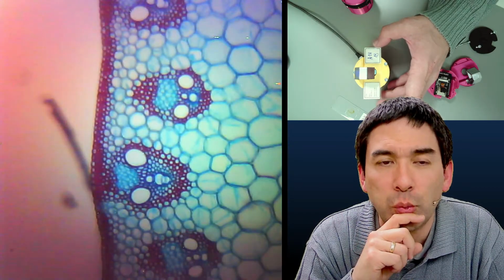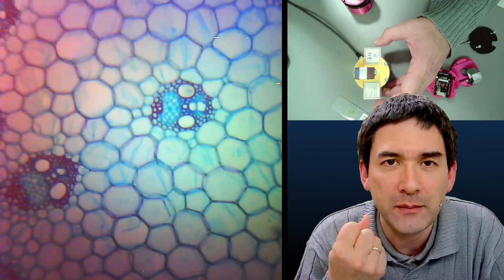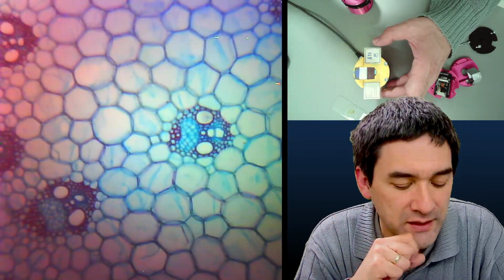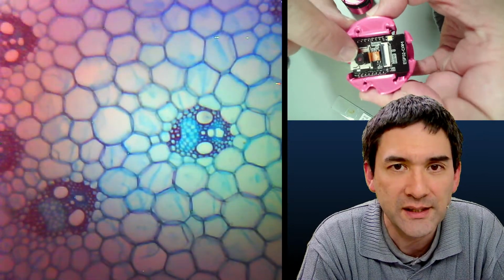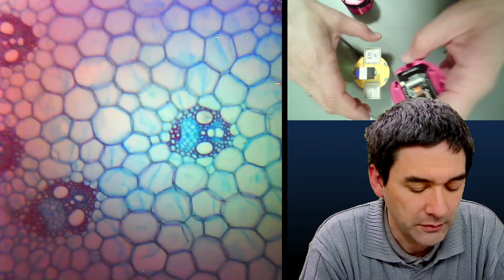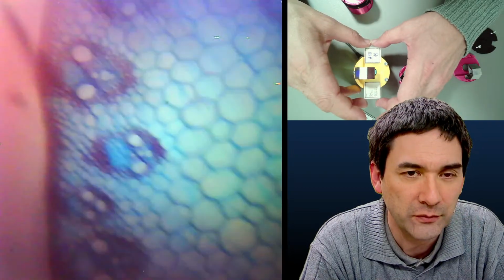Of course, the image quality cannot be compared if you're used to the very crisp images of a microscope with proper microscope objectives. I mean, it's clear because this is not a microscope objective. This is just the regular camera lens that you've got here. But I kind of like this system quite a bit, because it's so simple that essentially it works as well.